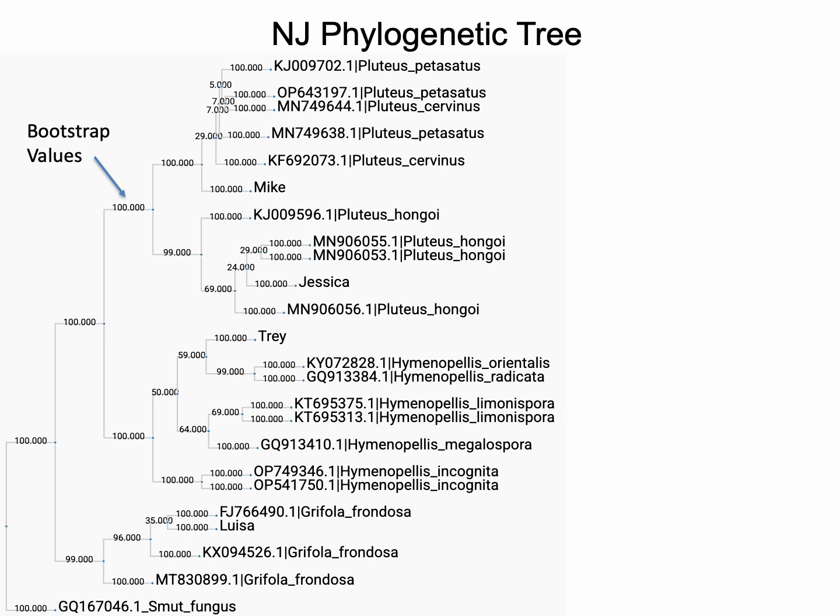Higher bootstrap values suggest a more reliable branch. For example, a bootstrap value of 95 means that 95% of the resampled trees contained that specific branch in that specific location, indicating a high level of confidence in that branch's existence in the quote-unquote true tree, if such a thing exists. A common rule of thumb is that values above 70 or 80% in bootstrap are generally considered well supported, though this can vary depending on the specific study and data set that you're looking at.